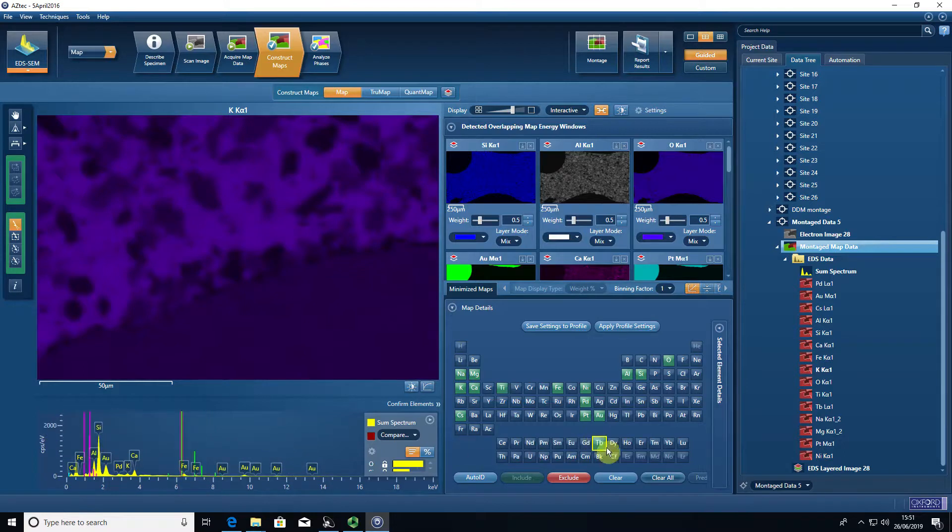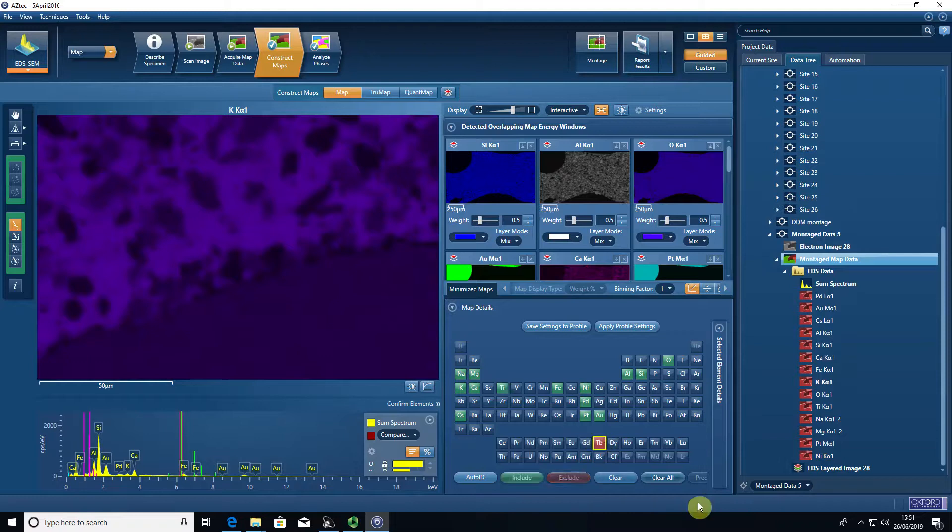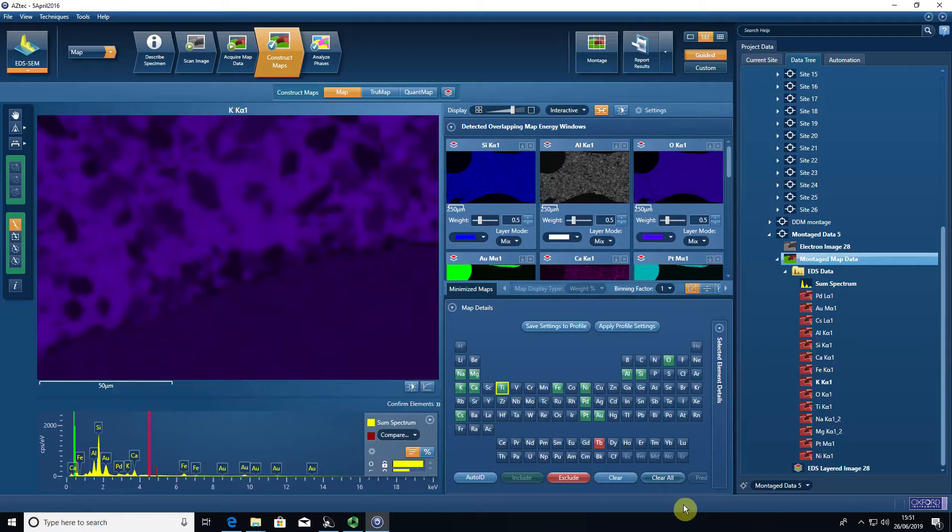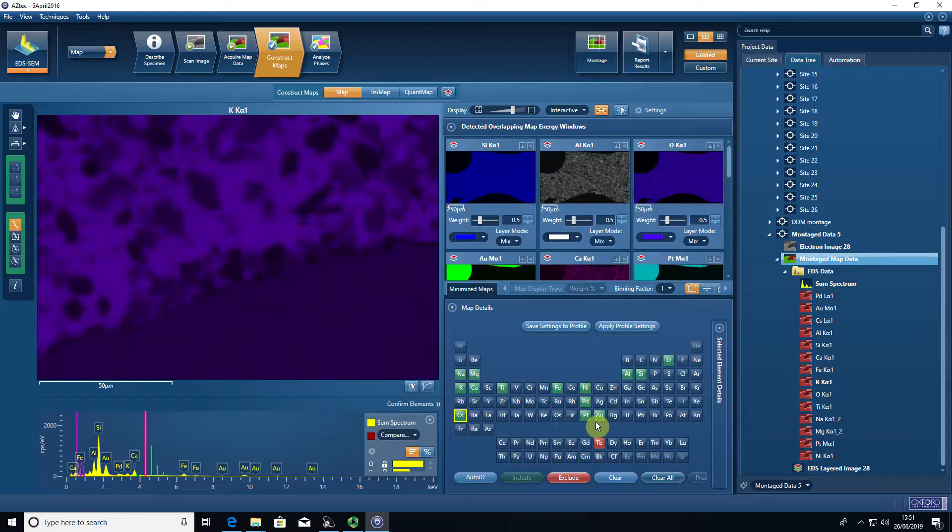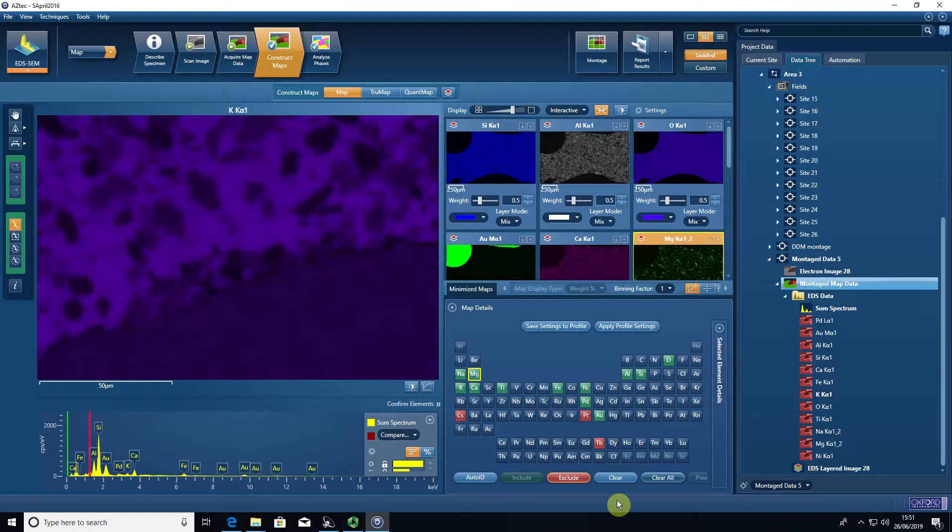So in this case, terbium is something which I know in this sample is not present at detection limits that EDS can pick up. So by double clicking that, I can exclude it, or I can click on it and press exclude. Cesium is another one. I'm going to press control and remove some of these elements. Platinum will exclude.